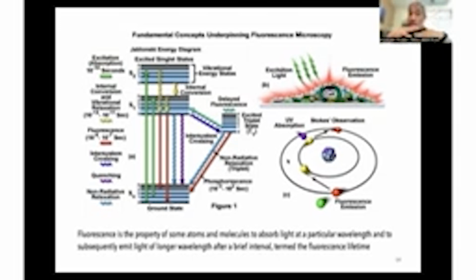So instead of just looking at what's there, you're looking at the fluorescence coming out from a very specific region of the cell, or a specifically labeled protein or organelle inside a cell, right? And that is determined by the fact that there is something fluorescent, which will absorb light at a certain wavelength and emit light at a different wavelength.